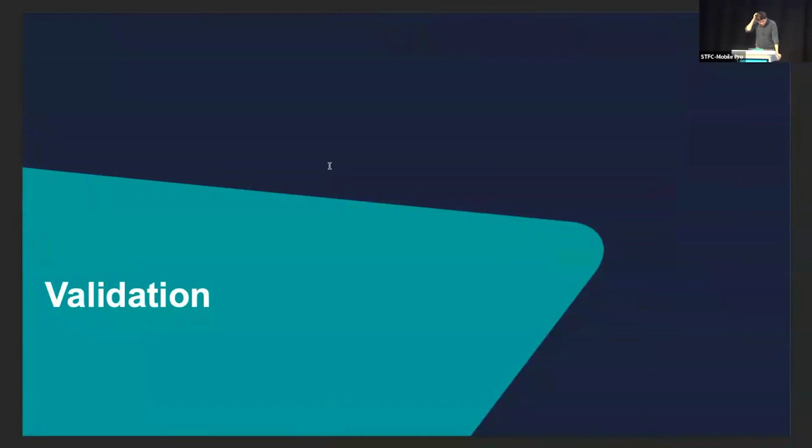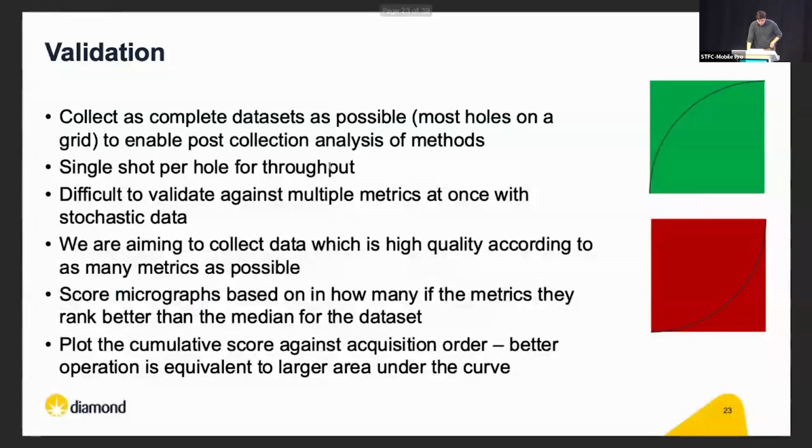Right, so I've got a few quick slides on attempts at validating the framework. It's quite tricky because of this same problem of everything being very noisy. You're looking at multiple metrics at once. Things tend not to correlate very well. Actually coming up with decent validation scores is a little bit of a tricky problem.